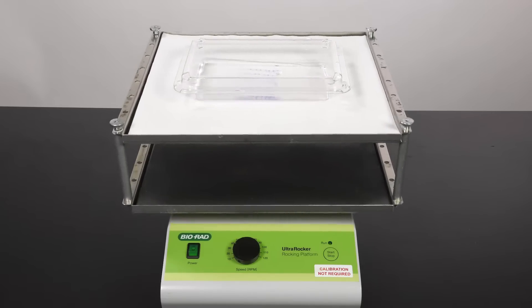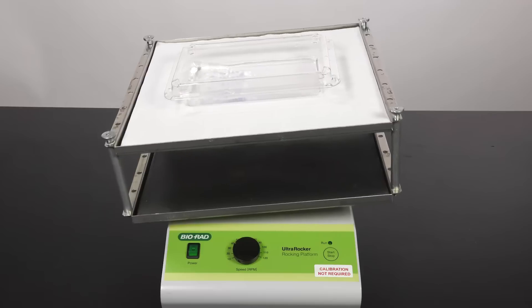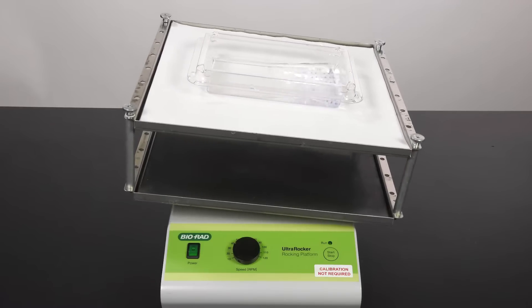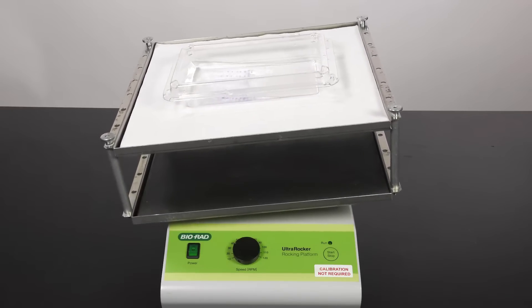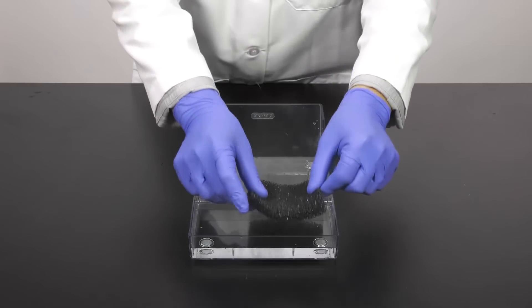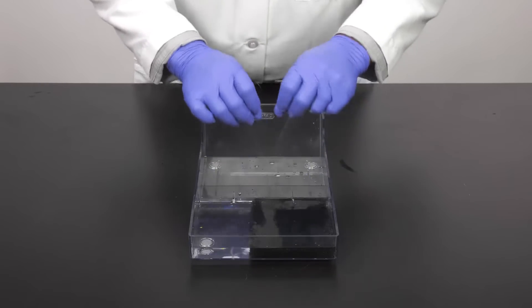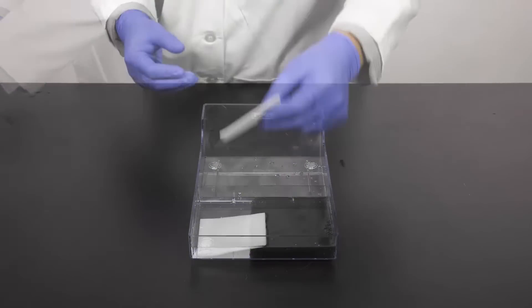After you have removed your gel from the gel cassette, equilibrate the gel in a tray with transfer buffer for 15 minutes on a rocking platform. Pre-soak blotting paper and fiber pads in the transfer buffer and ensure complete coverage.